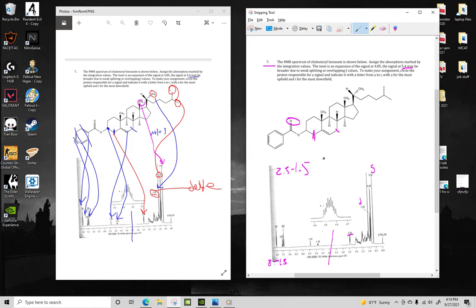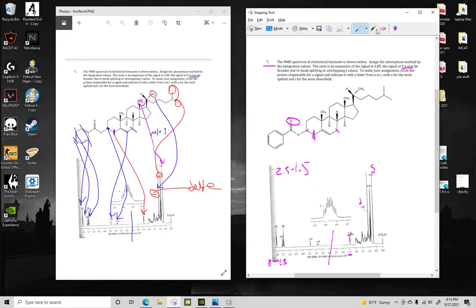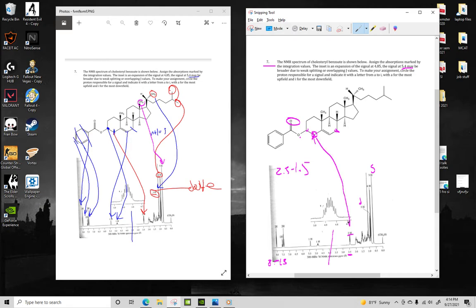You could argue which one it's going to be, and I would argue it's going to be these ones right here. It looks like a singlet, but we'll just call it a multiplet because it'll be split by these. But since it's at 2.5, it's more on the upper end. So I would argue that these hydrogens are more deshielded than these ones over here, since these ones are closer to an oxygen or carbon-carbon double bond.